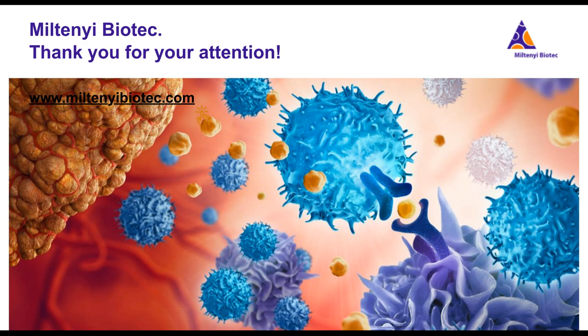Is there a surface marker that could be used for the enrichment of regulatory T cells? Oh, that's an interesting question. For the enrichment of regulatory T cells, we recommend to also use CD137. However, CD137 is expressed on activated CD8 positive T cells as well. So if you want to specifically enrich regulatory T cells, you should only stimulate your cells for about 4 to 6 hours. Then CD137 is expressed on regulatory T cells, while if you stimulate your cells for an extended period of time, you will also enrich CD8 positive T cells.